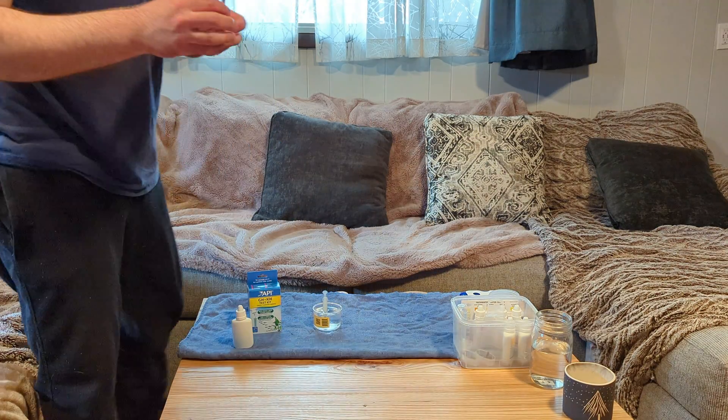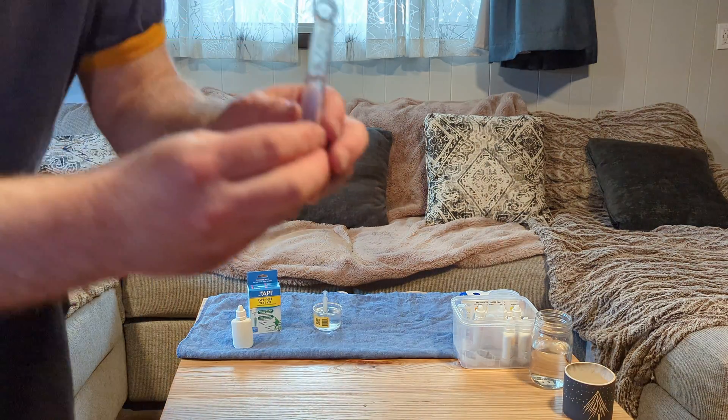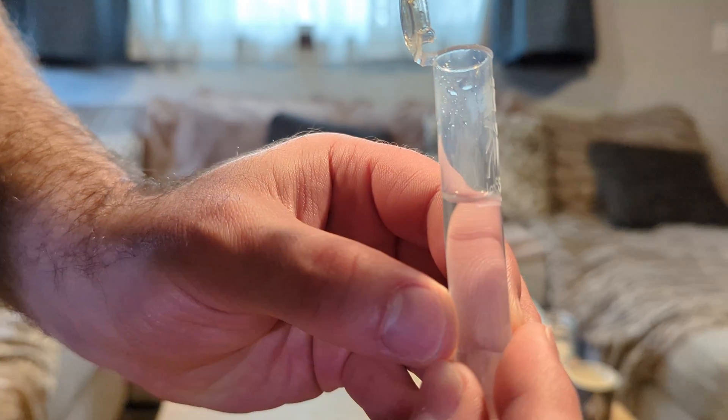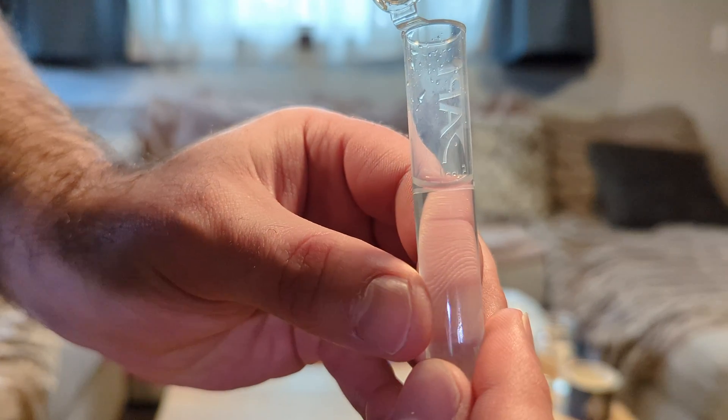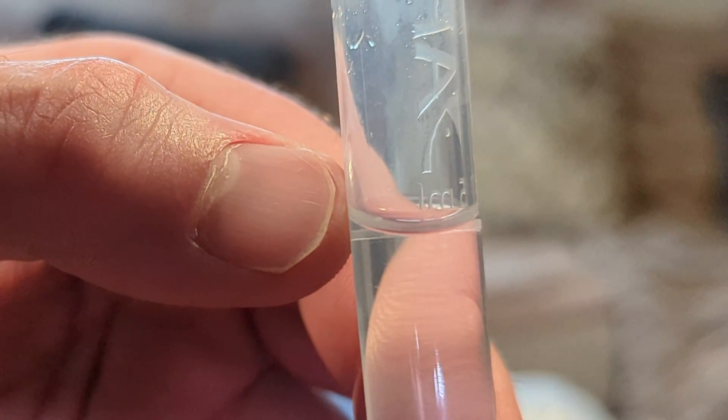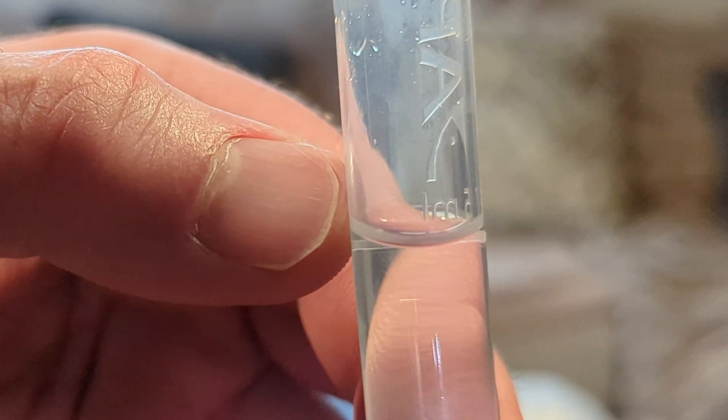Another thing to note is that when you fill up a test tube with water, you'll see that little divot in there and that's called a meniscus. You want the bottom of that meniscus to be on the 5 milliliter mark, and you'll notice that on the side it's slightly higher.